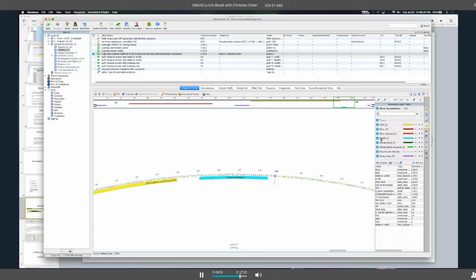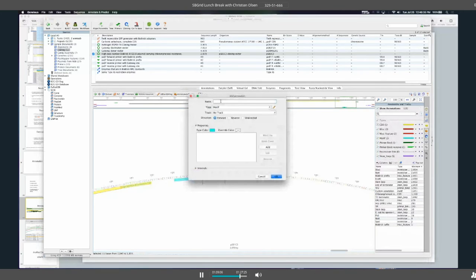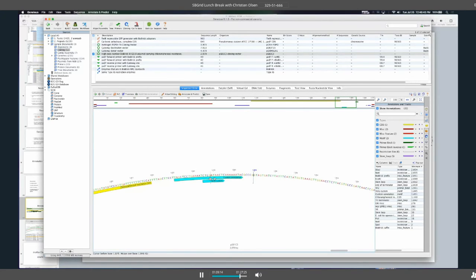Okay, this turquoise annotation was type motif, and it was added to my annotations menu. Okay, so as I move along, I can even select a region within that, and I can add another annotation. I'll do very custom. This is just kind of a cartoonish example. So I've added a sub annotation within my custom annotation region. Okay, and so now I've got two motifs that were added. Now notice in the Annotations and Tracks window, if I select or deselect, that turns on or turns off the annotation view in my sequence viewer.